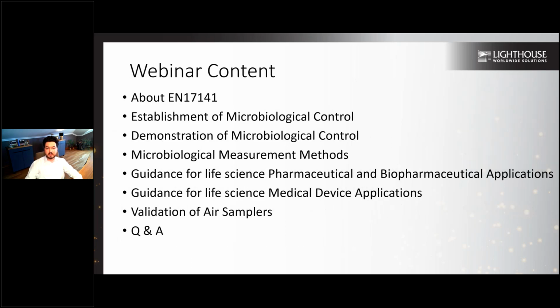Today's webinar content will be about the EN norm. I'm especially saying norm, not a standard, because this is a European norm, 17141. The reason we conducted this webinar is because this EN norm is quite new and also will enlighten our future in terms of ISO standards. I'm going to come later to this part.